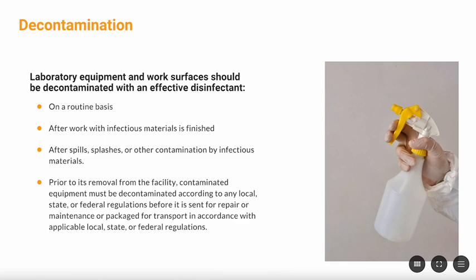It is also important to decontaminate any equipment that is to be removed from the facility before it is sent for repair or maintenance, or packaged for transport. This process should be done in accordance with local, state, or federal regulations to ensure that equipment is safe for handling and transportation.